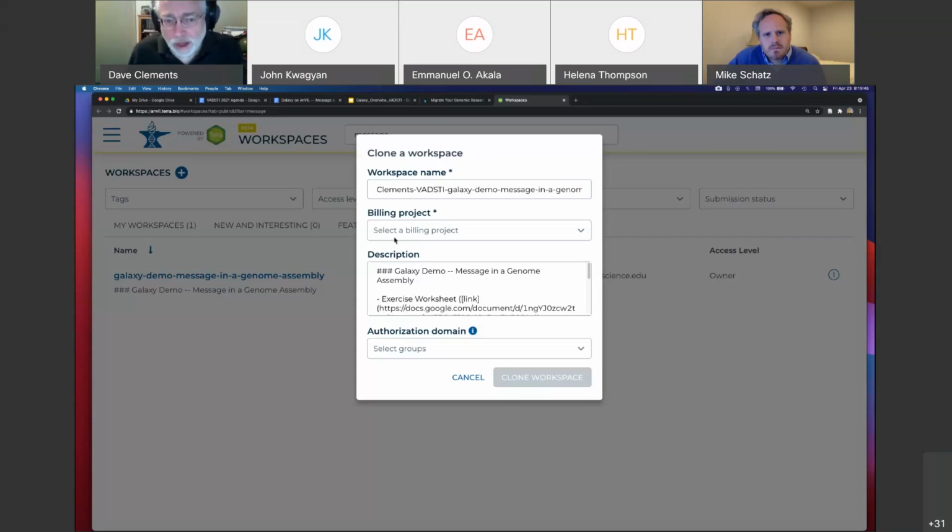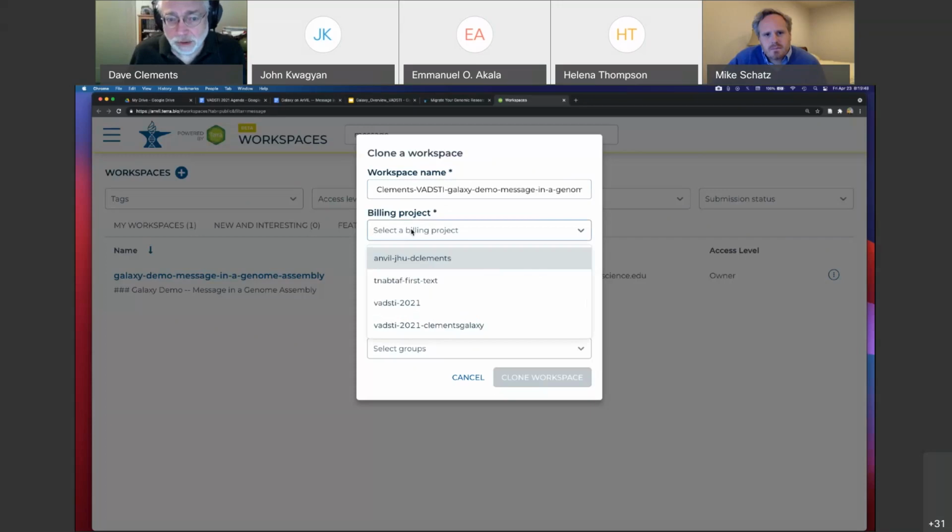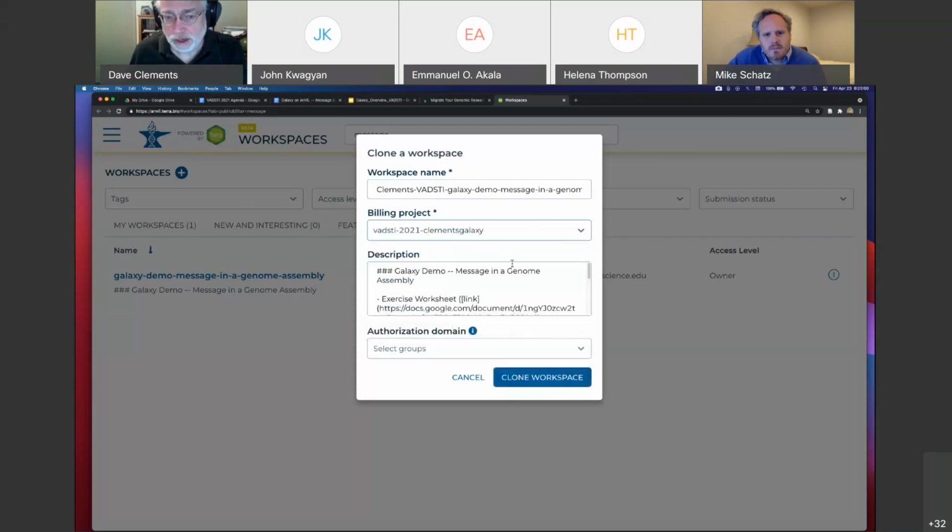And I'm going to select my billing project. I've got a bunch because I work for Anvil, and this is the one I want to use. It should look a lot like the one you have right there. Boom, I'm going to click on that. You should only have one billing project because you're new.